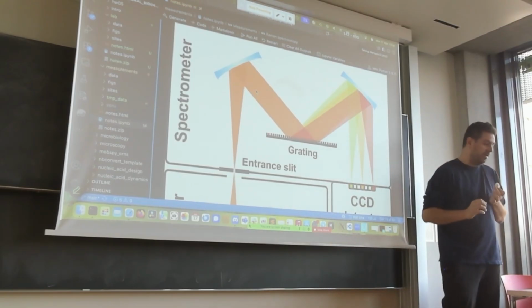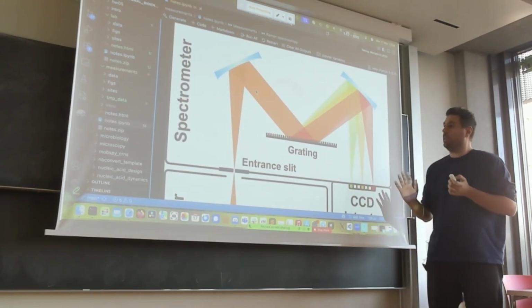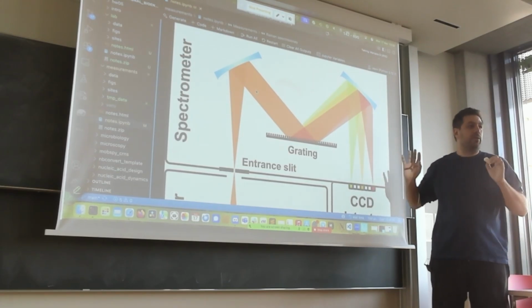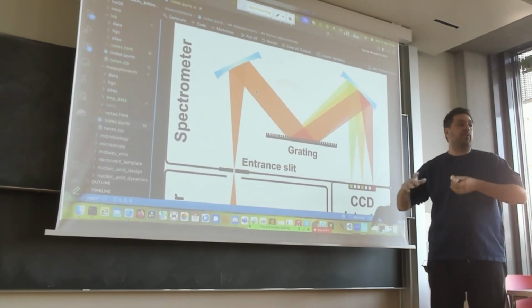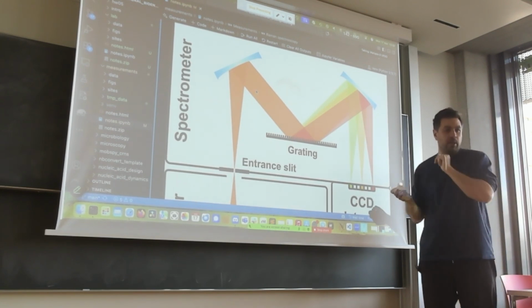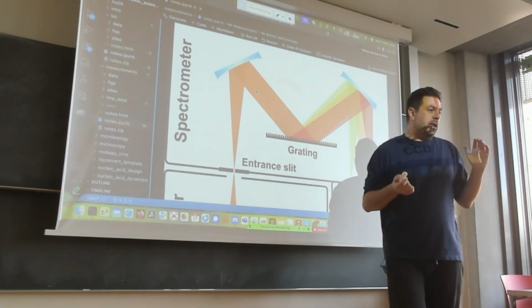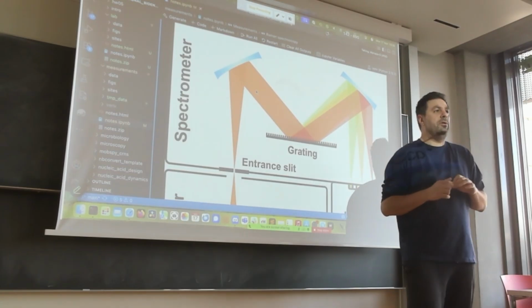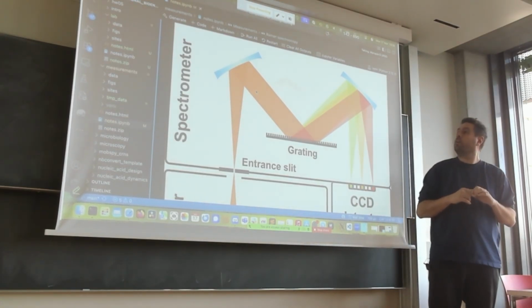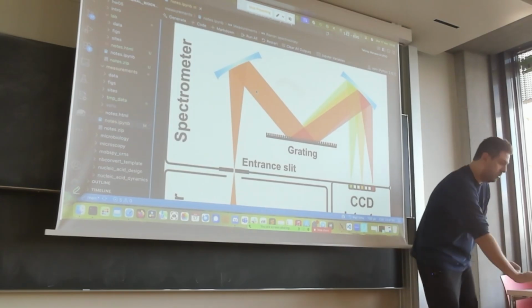But the principle is that you get a spectrum, and the things that we are going to see are not specific to Raman. You could use any spectrum essentially. We are just using Raman as an example because this is a technique that is more and more being used in biotech, and this is why we thought it's quite useful to look at this.